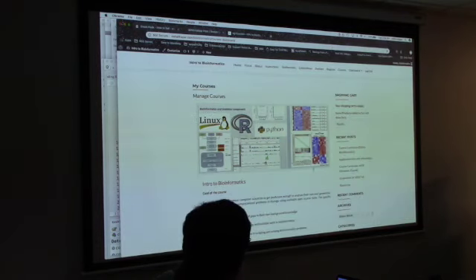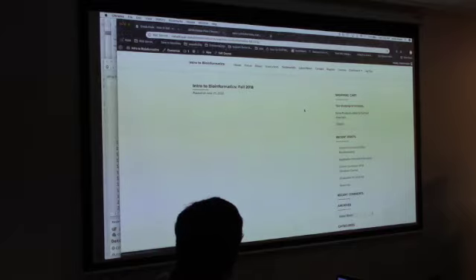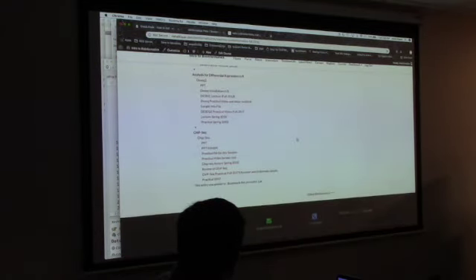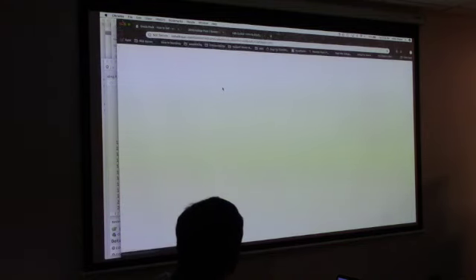So you're going to go here, you're going to select your course, which is this guy right here. You'll only have one, so you're good. And then scroll down to the GSEA part, which should be all the way here. It's not enabled. Okay. So that would be my issue to fix.